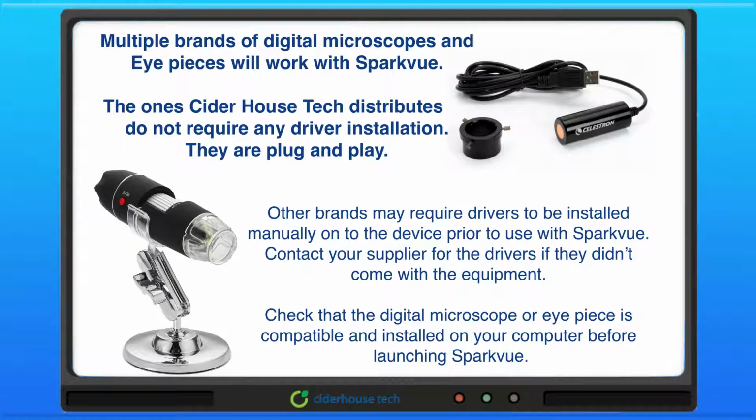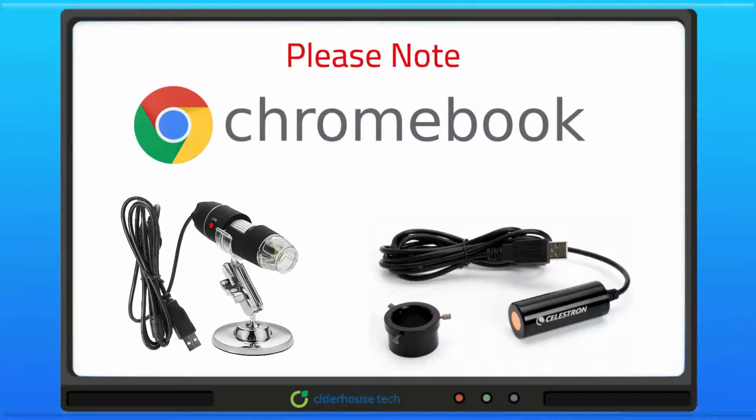Check that the digital microscope or eyepiece is compatible and installed on your computer before launching SPARKvue. Please be aware at the time of compiling this video, there are issues with Chromebooks and USB microscopes. Please contact us for more information if you have any issues.